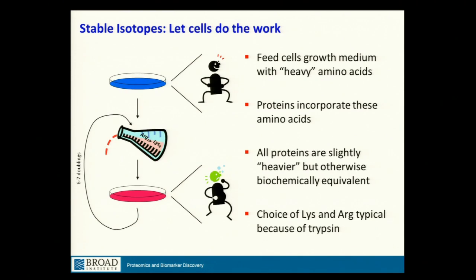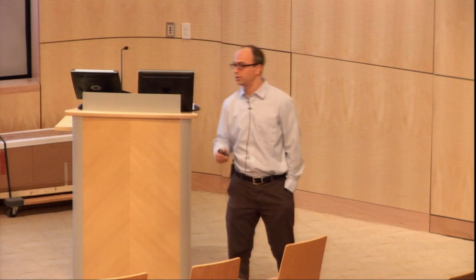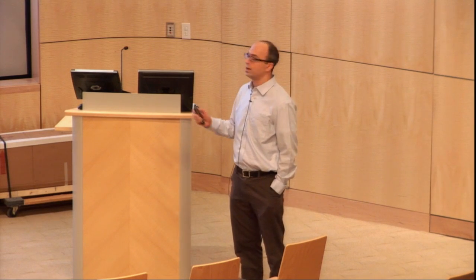So one very clever fellow exploited this. This was Xiaoan Ong, who had been a staff scientist here in the proteomics platform. And he said, well, this would be really hard to make all these proteins with stable isotopes, so we'll just let the cells do the work.